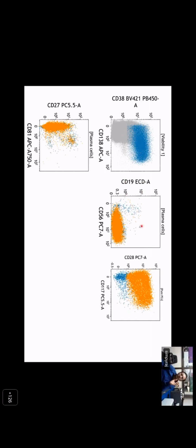Normal plasma cells show predominantly, not all, CD19 expression, but you can have a subset of normal plasma cells which can be CD19 negative. Then CD56 expression is aberrant expression. CD27 shows weak expression. So there are a few normal plasma cells in the background which are CD19 positive. They are CD27 and CD81 positive. And the other population which is CD56 positive shows loss of CD27, because they are close to zero, predominantly close to zero. Loss of CD81, as compared to these normal plasma cells.